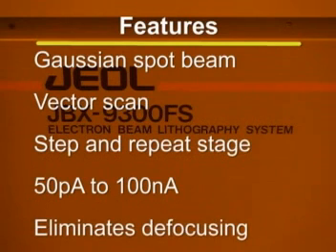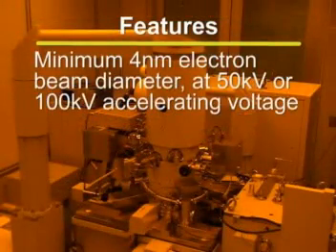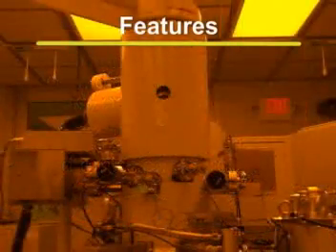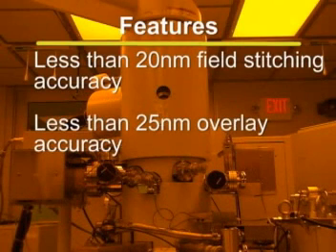Its dynamic correction system eliminates defocusing resulting from beam deflection. The JBX9300 is capable of producing a minimum 4 nanometer electron beam diameter operating at either 50 kilovolt or 100 kilovolt accelerating voltage, and utilizes a zirconium oxide tungsten thermofield emission source. The system has less than 20 nanometer field stitching accuracy and less than 25 nanometer overlay accuracy at 100 kilovolts.